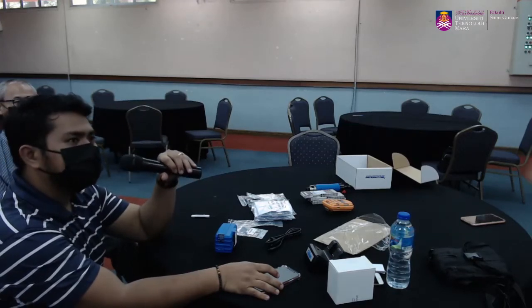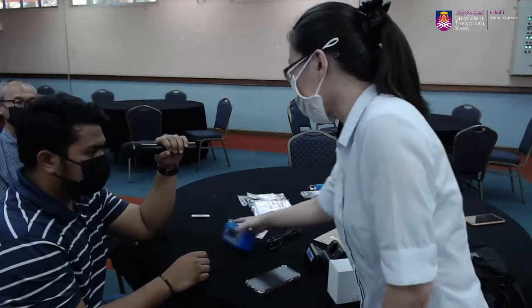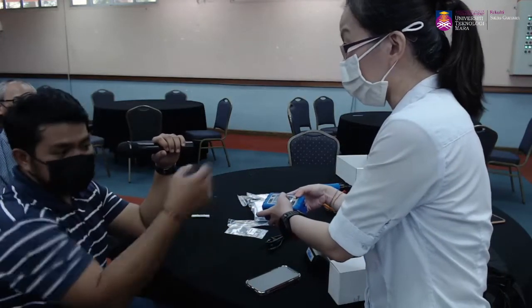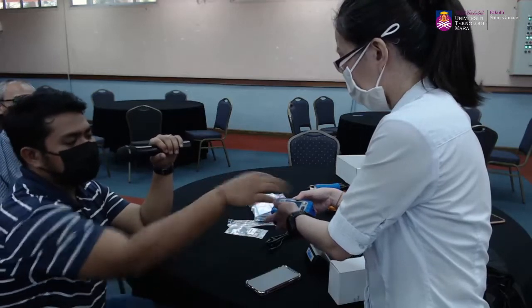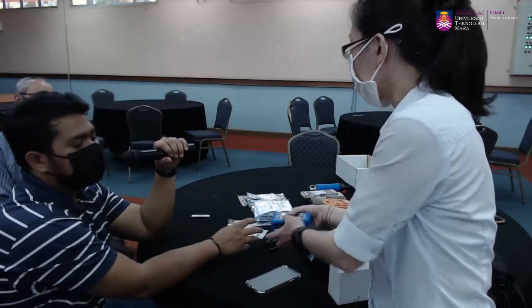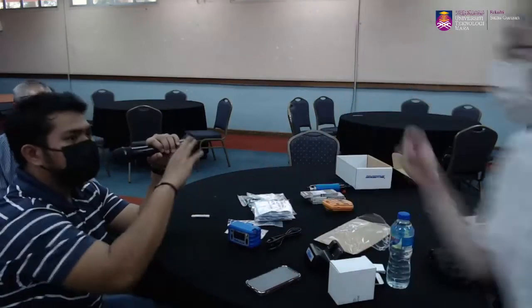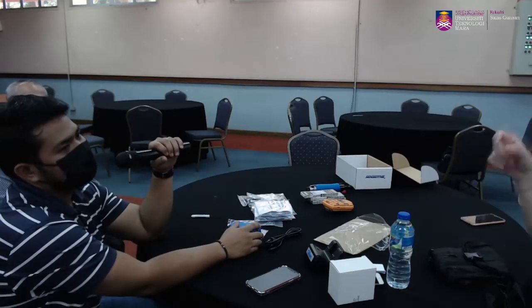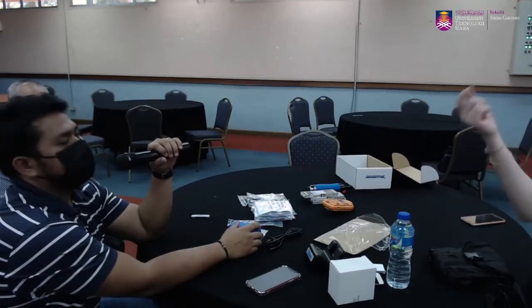Maksudnya? It's not complete 5 minutes kan. Aha. Dia tak complete. Bila kita tekan up and down, dia akan keluar. Kalau kita release the on off button tu, means that dia akan go back to the main screen lah. So kalau kita tekan sampai habis 7 seconds, baru dia akan completely off. Yes.